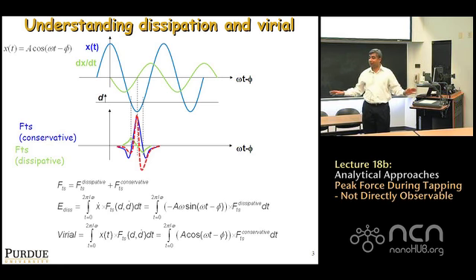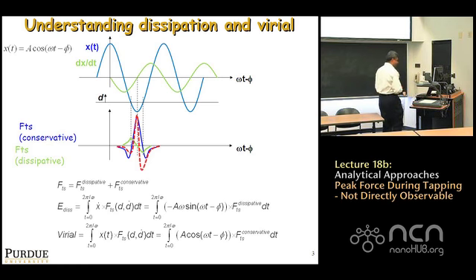So if you start doing it, we can start this movement to use, let's say, the duality of phase. It's a dual nature of phase, right? You get both information out of it. So let's make a compact here, and all of you, when you take phase images, now let's do sine and cosine, and let this be the Purdue school of thought. Duality of phase.